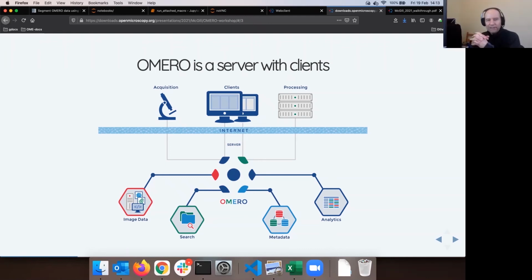So I hope that that is clear. Okay, that this is the typical situation. The vast majority of the Omero servers running, and now by Omero server I mean the real thing, the software plus the hardware, because the software, of course, is nothing without the hardware to run on. Okay, so until the institution overtakes this free software called Omero server and puts it on their hardware, then you don't have an Omero server. That's as easy as that. You can't use it. Okay.